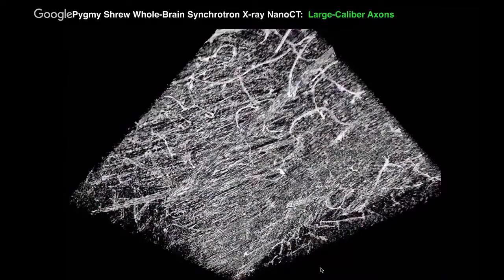If you look carefully at this data in the white matter, and you rotate that stack a little bit so the external capsule is facing you, and you adjust your lookup table correctly, you see something like this. Now you see the telltale morphology of blood vessels in the upper part. But if you look at the lower part, you can see bundles of tube-like structures, which I think can only be one thing. Those are large caliber axons, the vast majority of which would be myelinated axons.